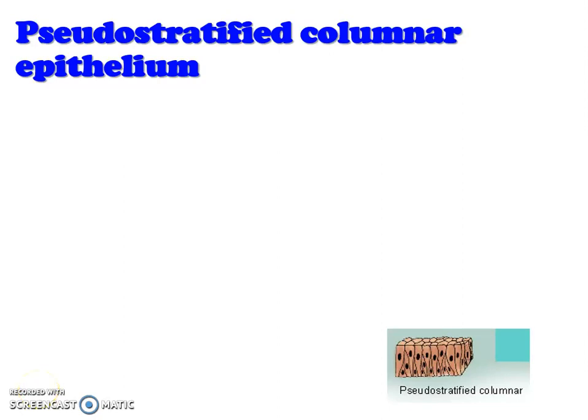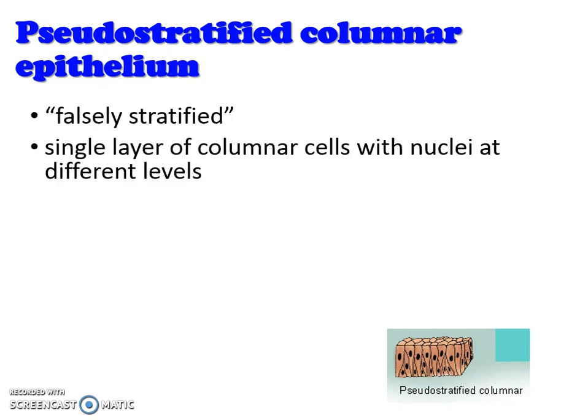Now, as we mentioned a few moments ago, pseudostratified means false stratified. So it's really simple columnar epithelium. But at first glance, when you look at it, the cells are going to appear to be stratified. So this is falsely stratified. It's actually a single layer of columnar cells.